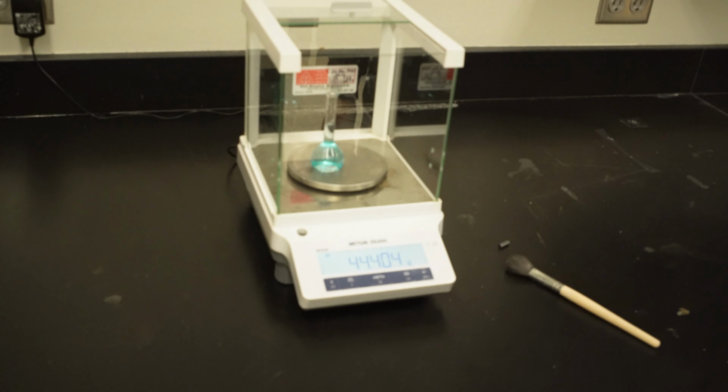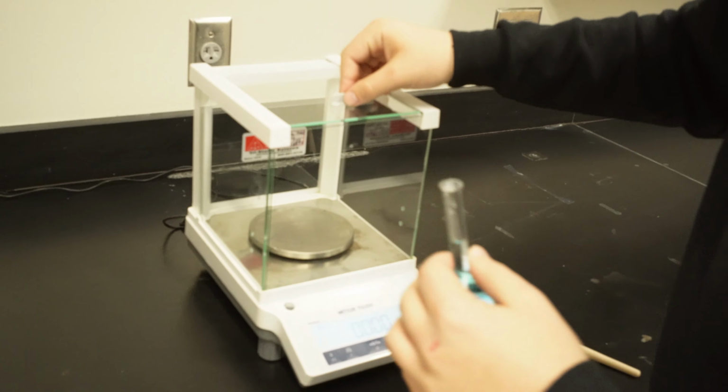Once you've serially diluted and obtained your solutions, you can start to weigh all of them, as I'm doing here. We are weighing them to obtain the density, and the equation for density is mass over volume. We know the mass because we're weighing it right now, and we've obtained the volume in previous steps.